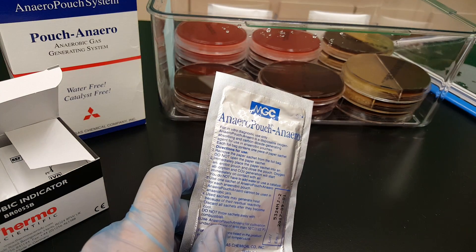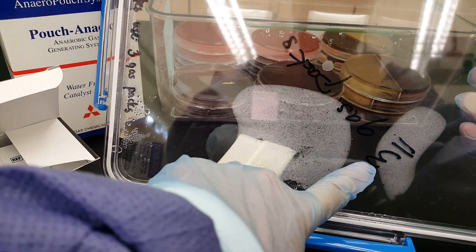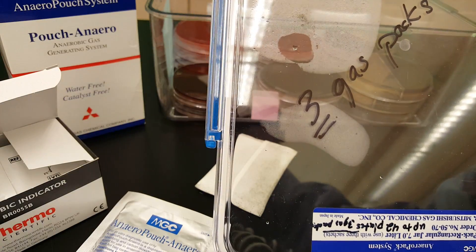This large container needs to have three gas packs in there. I marked it on the lid, and all of the anaerobic containers that we have do have the markings on the lid.